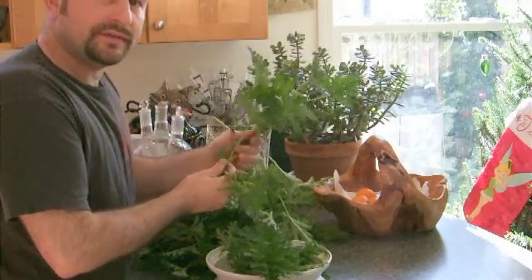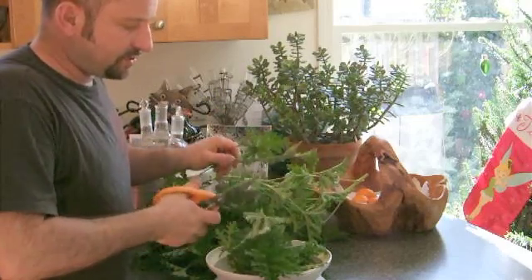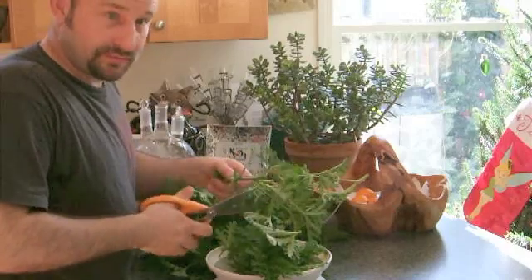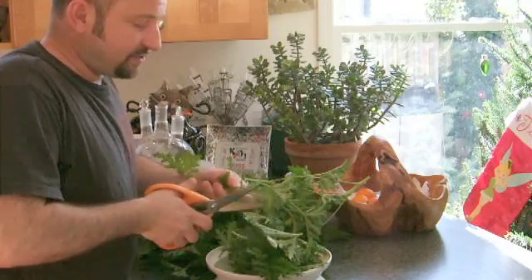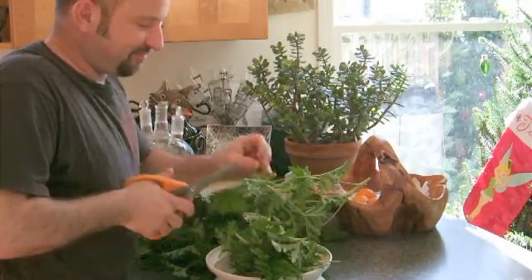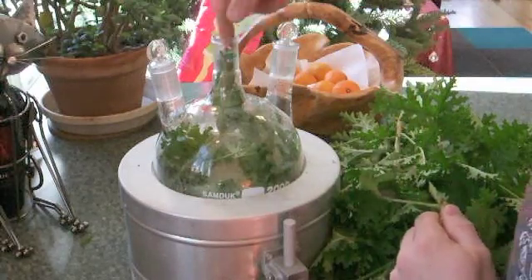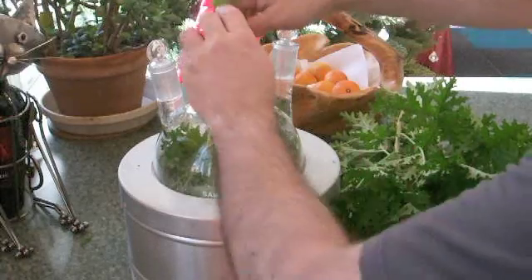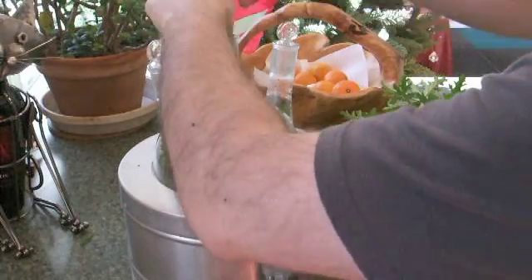You can really pack it into the flask too because it really cooks down with the steam. We're going to do steam distillation and so what we'll end up with at the end is just a mush which can go on the compost heap. We've got about 400 grams of plant material here and I'm putting all of the green parts in the flask.